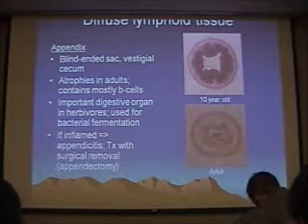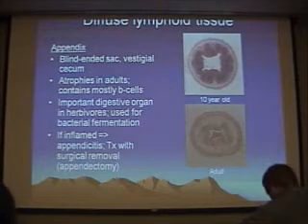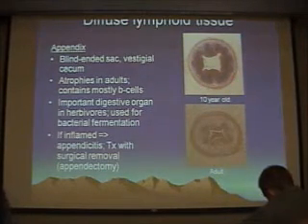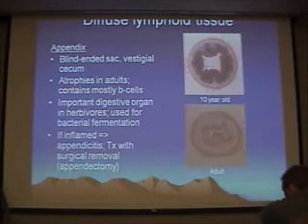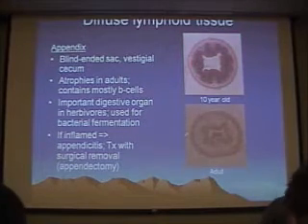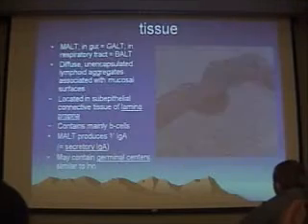Diffuse lymphoid tissue, the most organized of the diffuse lymphoid tissue is the appendix. Basically looks like so many aggregates of lymphocytes. You may see follicles. They may have germinal centers. They'd be secondary follicles. More active in children. In the adult, it becomes vestigial, just like the thymus.